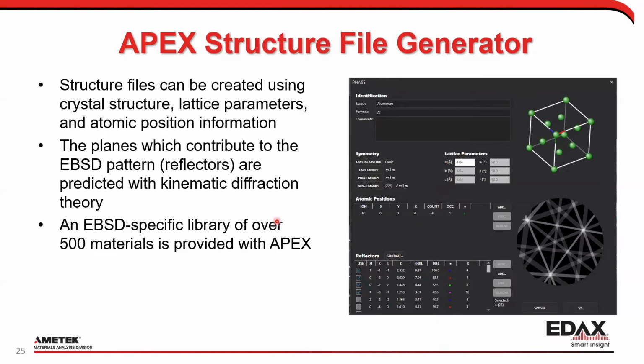So in general, we have our own EBSD specific library we've collected over the years. It's basically the stuff we run into. So the most common stuff is already basically in our own database. So usually it's there.